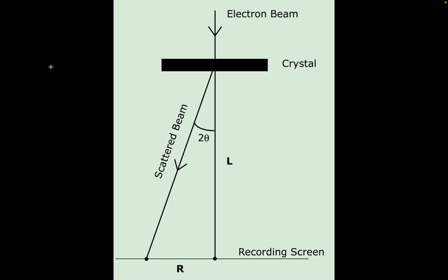It's actually very easy to understand. It's simply the physical distance from your sample to the detector, which is labeled L in this diagram. So if you're using some kind of crazy fudge factor like 20 meters for your camera length, you're probably not using the correct detector parameters. Why does this matter? It's always best to understand your experiment and not treat it like a black box, because that's how systematic errors happen.